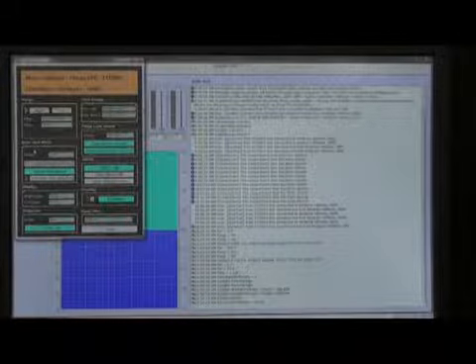Okay? From pump, this is rear seal wash. More option, more option, and rear seal wash. Mode active. No stop time. It will automatically stop. After 2-3 minutes, it will stop. Okay. No need to give a stop time.